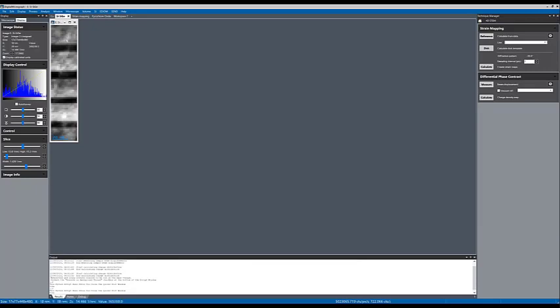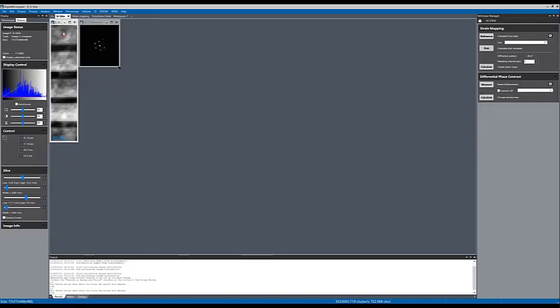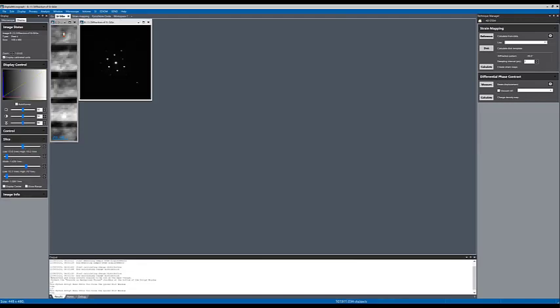And from that, measure the strain. Okay, so to do that, sorry, I wanted to show you one more thing. If I put the picker tool on this data set now, you can see this is silicon on zone.